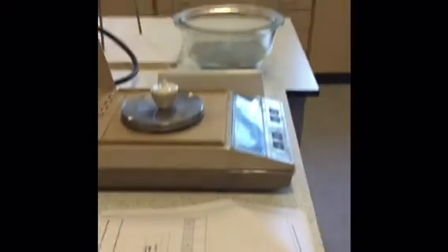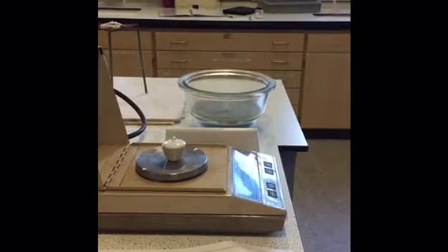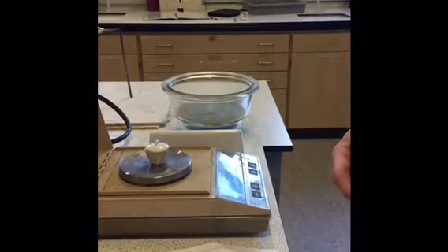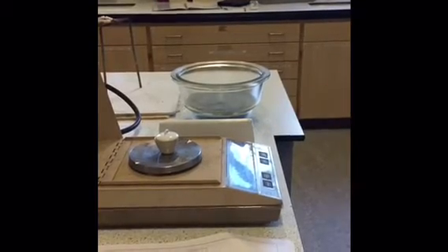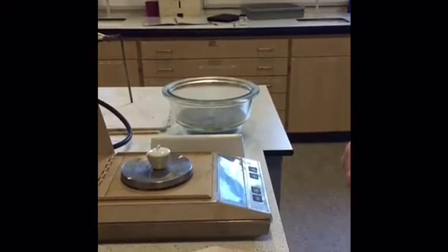Okay. Now we're going to repeat that whole procedure again, until we get two results that are within 0.002 grams of each other. At that point we can say we've driven off all the water and what's left is just the barium chloride. It may take 3, 4, 5, 6 cycles before you get two results within 0.002 of each other. You just need to see what you get.